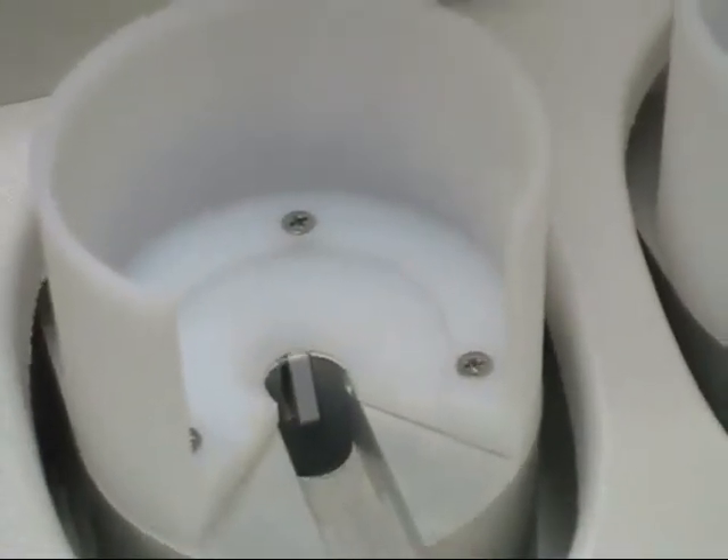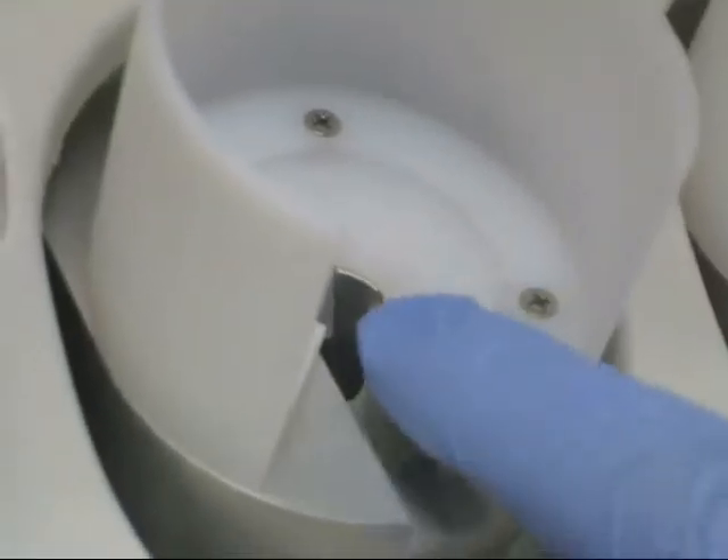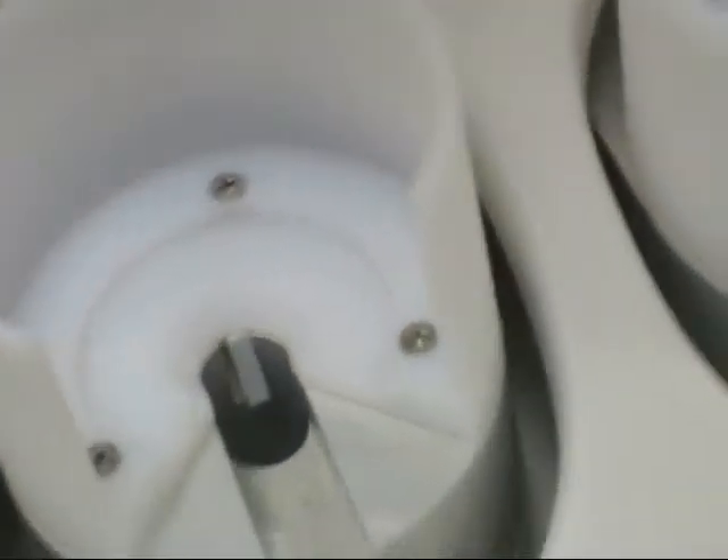Taking a little look inside the cradle — this is actually what supports the glassware there. Inside here, this is the switch that actually triggers the mechanism for the heater to come on and off — the safety mechanism. And then to the sides there, you can kind of see a little IR sensor. There's one on either side and that's what looks through the glassware and sees the meniscus.